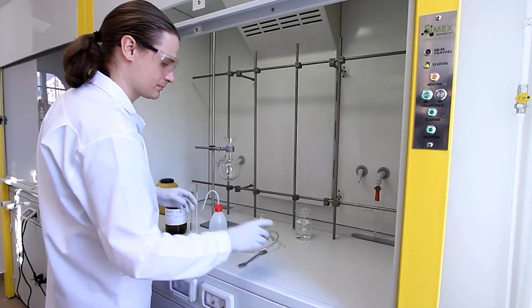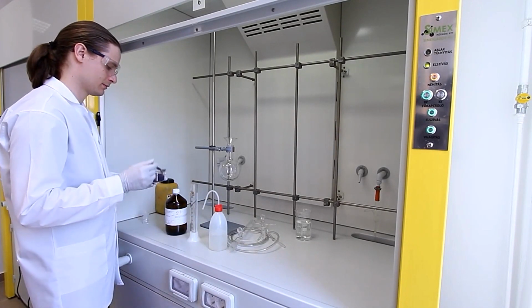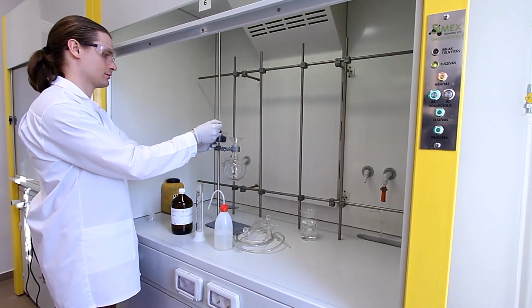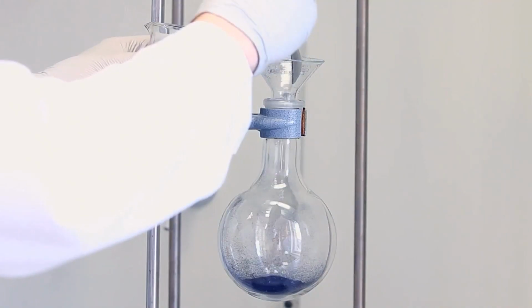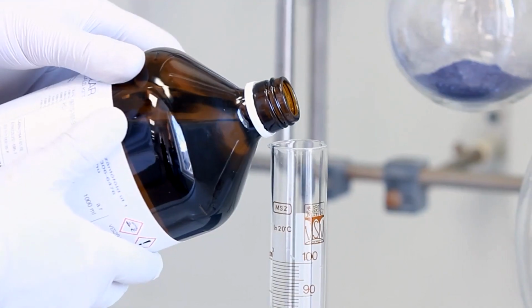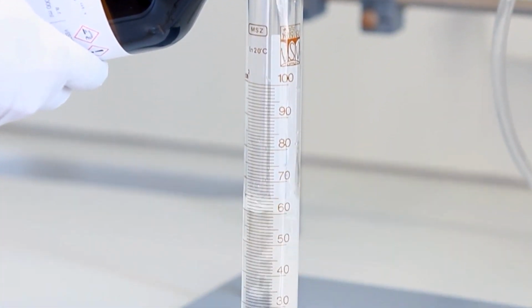First of all, we will need chlorine gas, which can be produced through the oxidation of hydrochloric acid, using potassium permanganate as an oxidizing agent. In this reaction, the oxidation of the chloride ions in the hydrochloric acid results in the formation of chlorine gas.